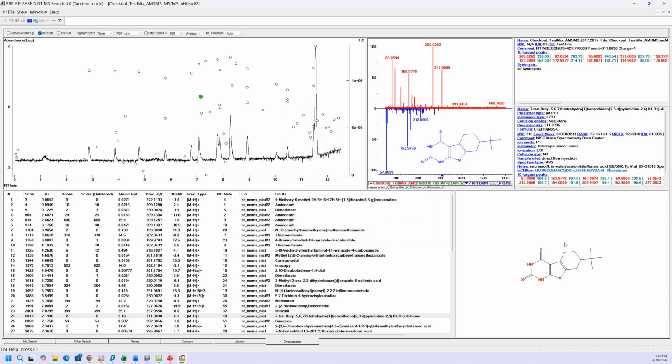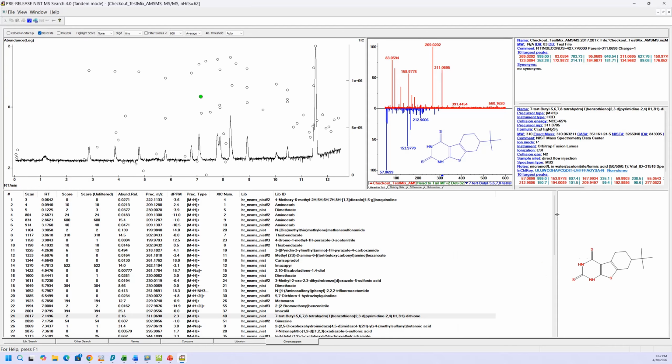There's also this structure down here, and if you get a lot of columns sometimes, you might need more space here. And I don't particularly find this one useful, so I just grab it with my left button with the double arrows that show up and just push it over. And that gives me more room to add columns or show longer names here. And so that's something you might want to change for the structure.